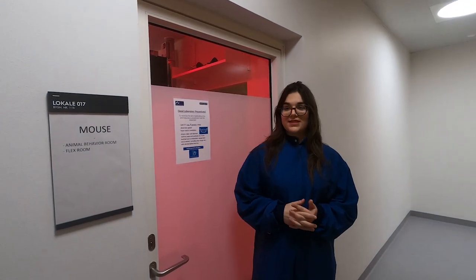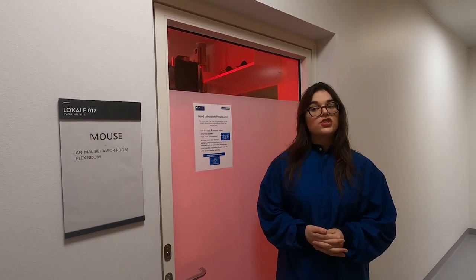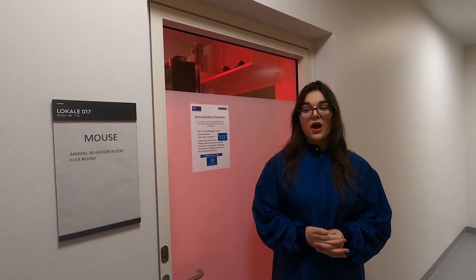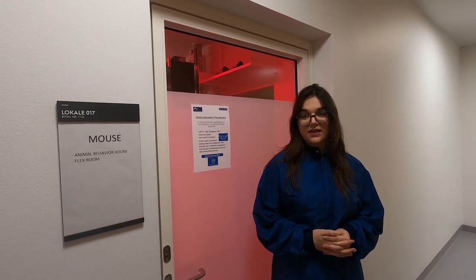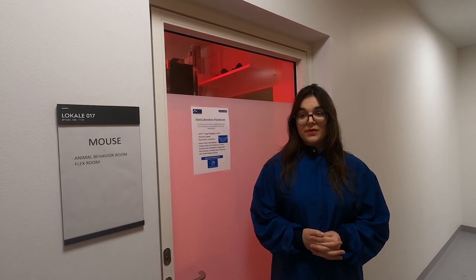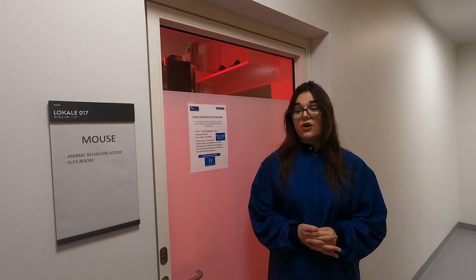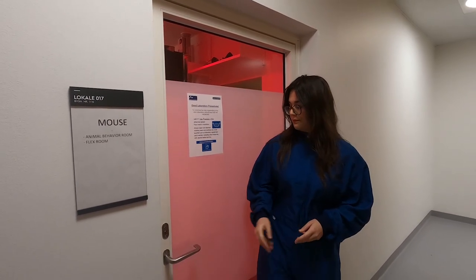We are now in the animal facility where we keep our mice in a clean and calm environment. To evaluate neurological and psychiatric disturbances, we often subject the mice to behavioral testing. We can examine motor skills, anxiety, depression, curiosity, memory-related tasks, social interaction, and so on. We will now visit DONGIK, our expert on mice behavior.